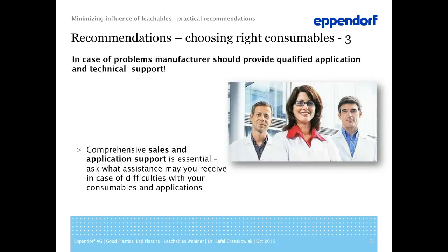And of course, last but not least, it's really important to get professional support in case of problems. Comprehensive sales and application assistance from the manufacturer side is actually very important in case of difficulties with your consumables and respective application. It will save you time, money, and of course a lot of stress. These were some practical tips and recommendations on how to minimize the influence of leachables, and I hope it will really help you avoid major problems and improve your laboratory workflows.